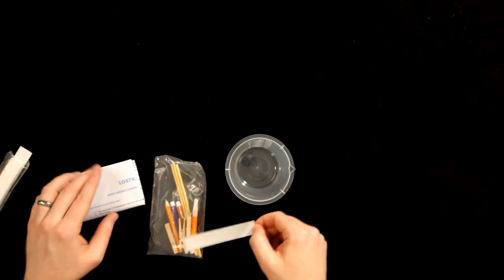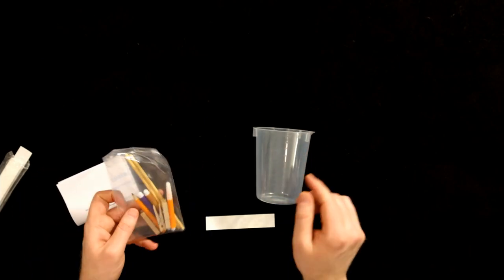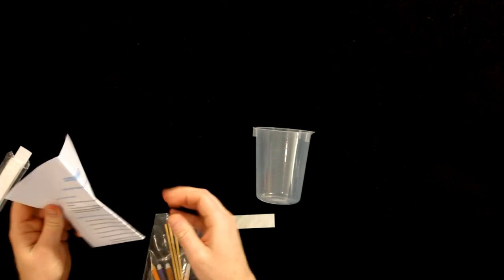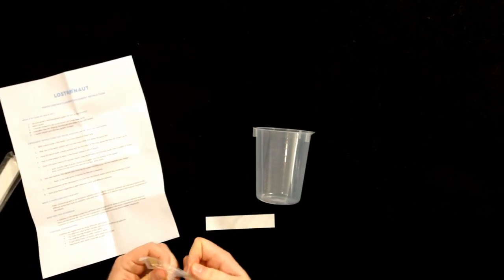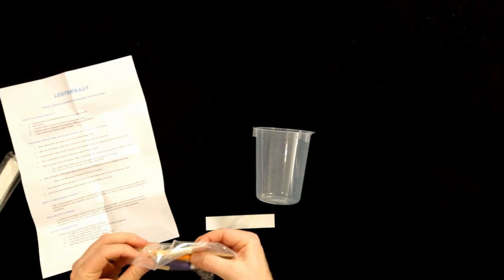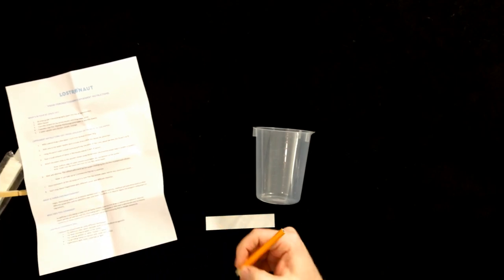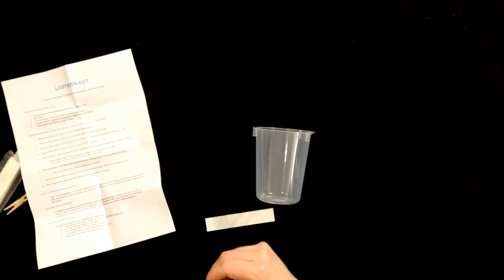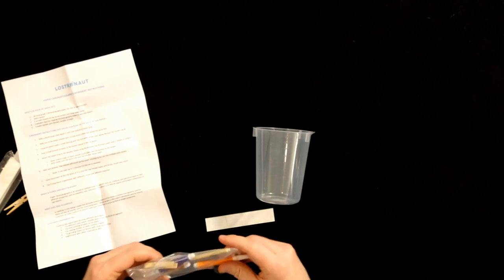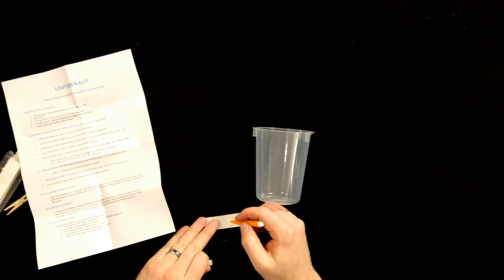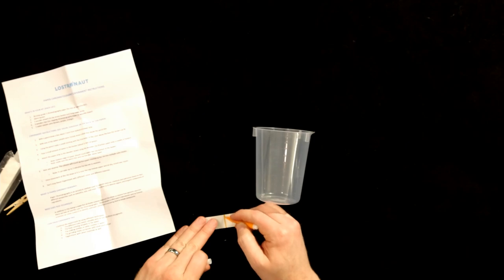So they've given us paper, a cup, and some various implements. The way these are going to go together are going to be described by their little instructions. Let's see how good those are. Draw a line. They include a pencil, which is great. About an inch up. With one of the colored markers like this one, draw a line above the pencil line. This is a thick line.